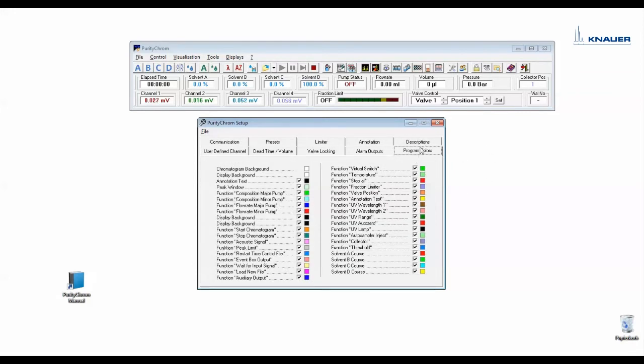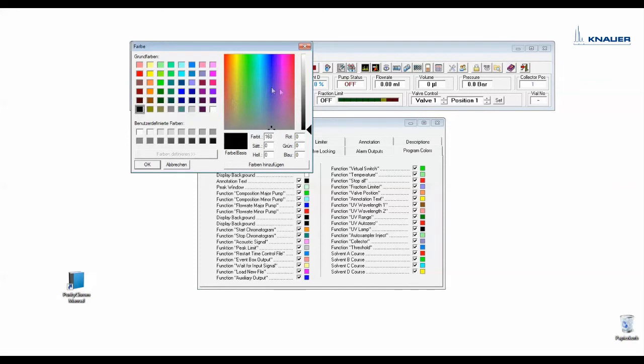In program colors you can change every color as you like. Simply double click on it and change it.